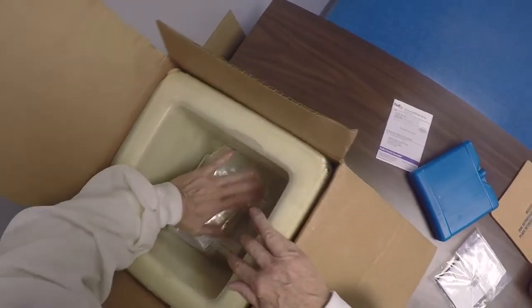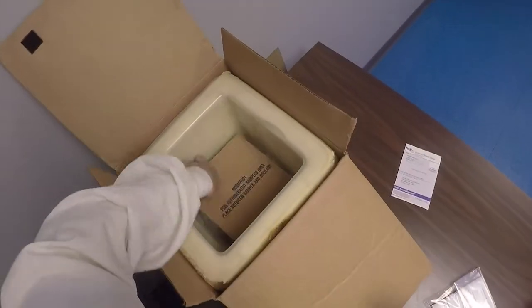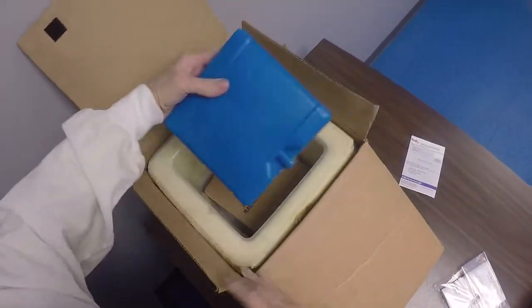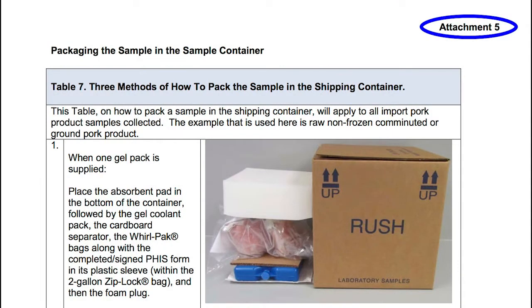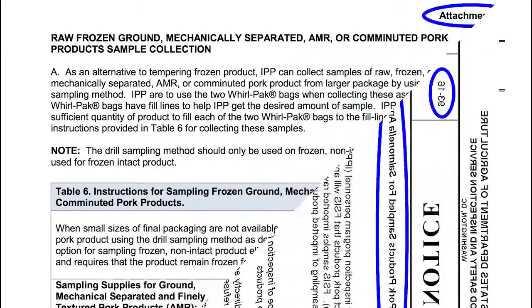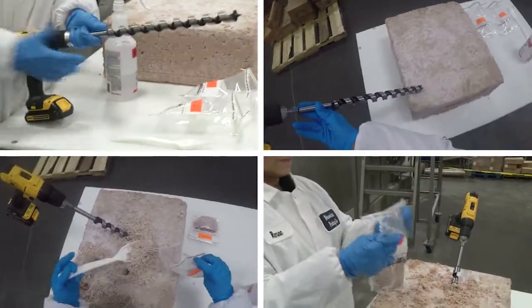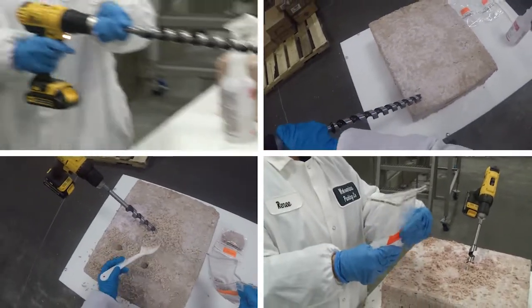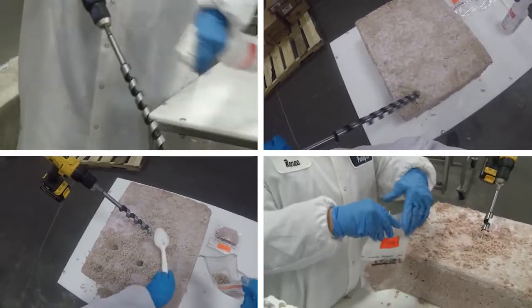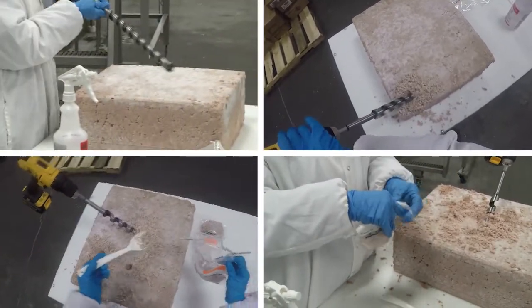This video demonstrates packing the samples when one gel pack is provided by the laboratory. Use the number of gel packs that are provided by the laboratory. This process, including all three methods of shipping the samples, can be reviewed in the FSIS Notice Imported Raw Pork Products Sampled for Salmonella Analysis, Attachments 4 and 5. By viewing this video and reviewing the FSIS Notice, you should be able to effectively sample frozen, non-intact meat and poultry products and avoid the long process of tempering product unnecessarily.